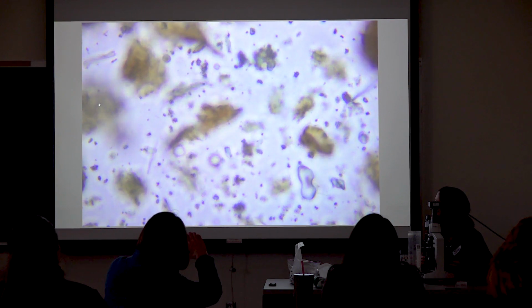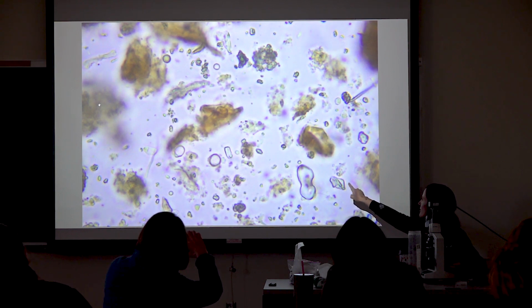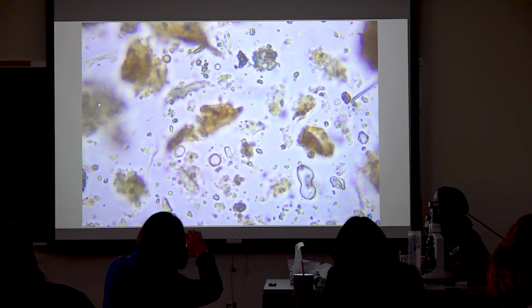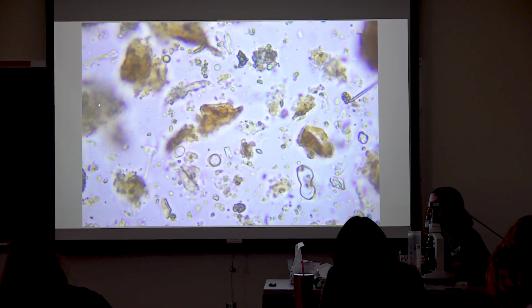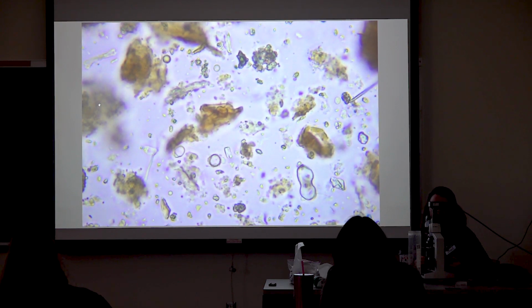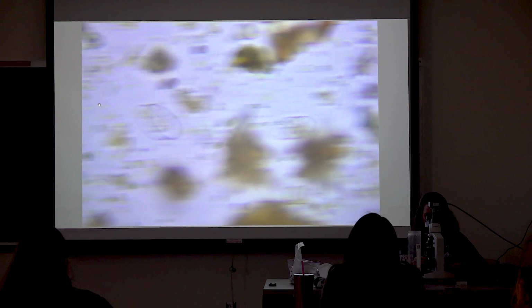Okay, so some of the things that you're seeing here. Whenever you see these really jagged particles like this, sometimes they're clear, sometimes they're not. Those are just minerals. Often you're going to see that in really sandy places. Sand particles, sand granules can look like that. Really sharp edges. You're still not quite seeing the same thing as me. Wowza.